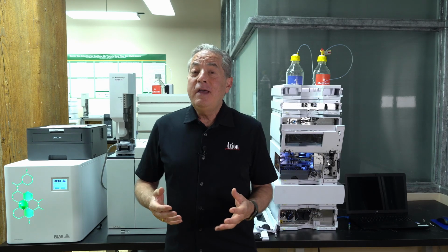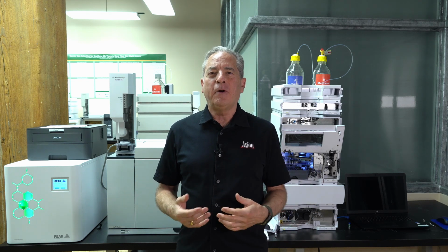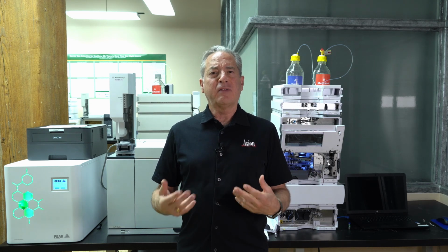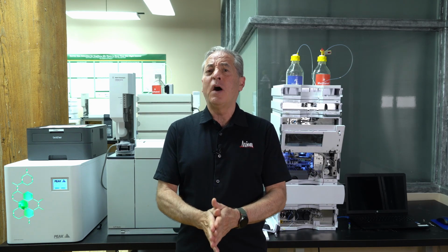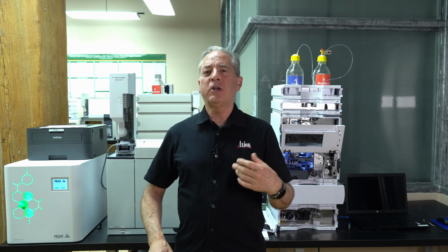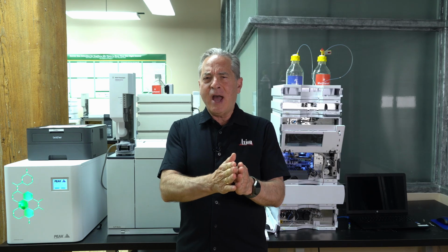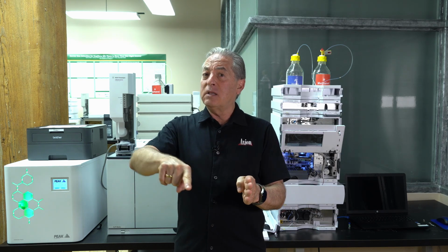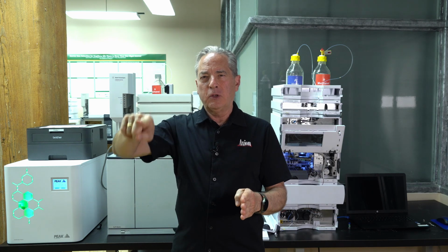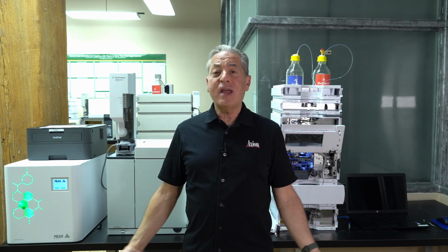So retention time, very important in both chromatography, both LC and GC, and very simple. And that is, retention time is the number of minutes it takes a molecule to come off the column. It's measured from the point of injection to the apex of the peak. So when we start the injection, we start the stopwatch, we reset it to time 0, and we time how long it takes the apex of the peak, not the first molecule, but the average of all the molecules, to come off. So the retention time is important because it's how we identify things.